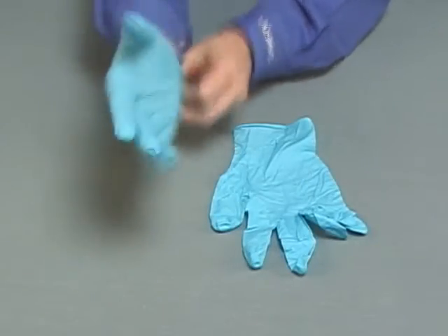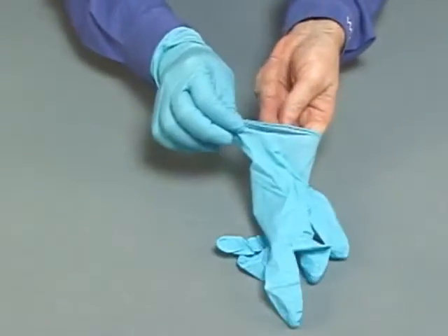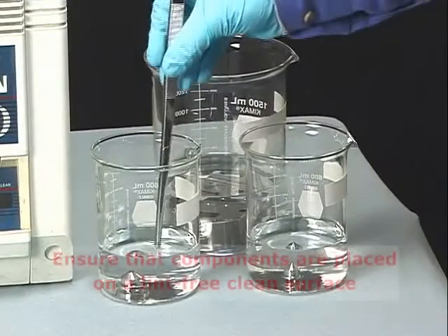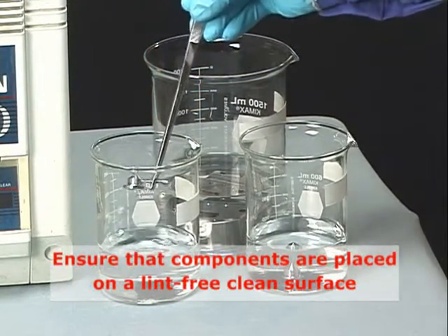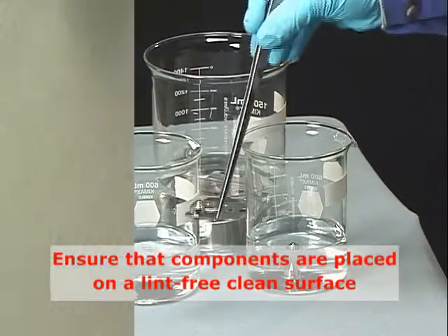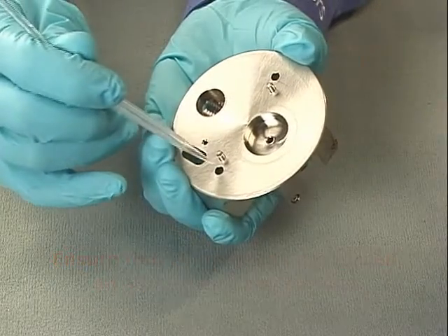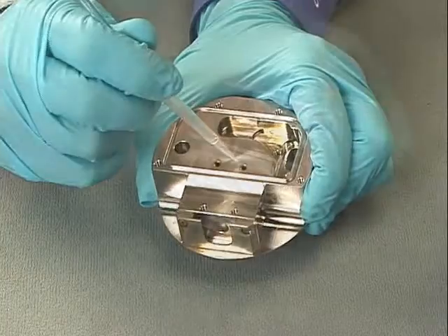To avoid recontaminating the components, wear clean, chemical-resistant, powder-free gloves for the rest of the procedure. Carefully remove the sample cone, cone gas nozzle, and ion block from the vessels. You can blow dry them with inert, oil-free gas. Pay particular attention to drying screw holes and other areas that could trap liquid.